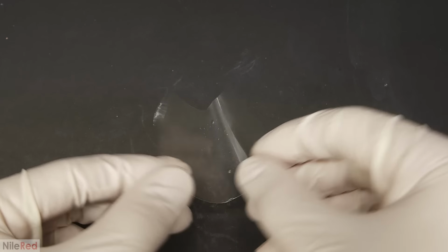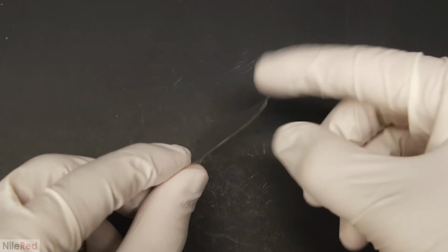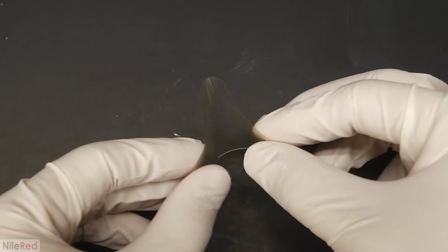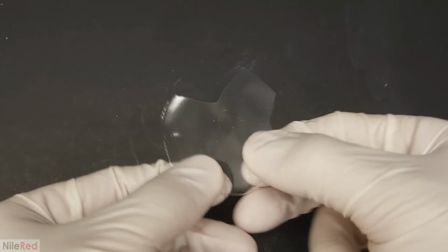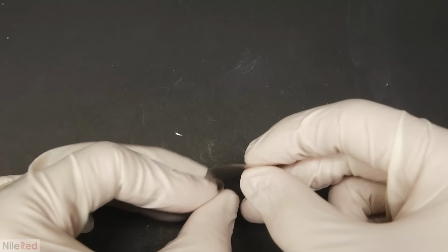I think the reason why it's still kind of brittle is because of the low quality cellulose acetate I'm using. Even after everything was dissolved in the acetone, it was still a cloudy mixture because of a bunch of impurities. As the film forms, the impurities get incorporated into it, and I'm sure they impact the structure and quality of it in some way.